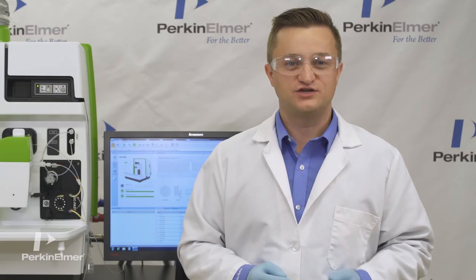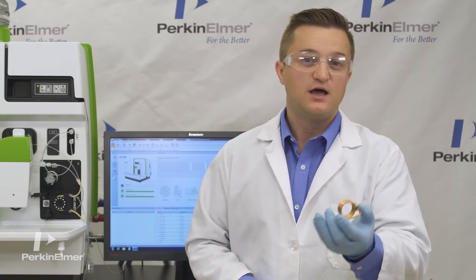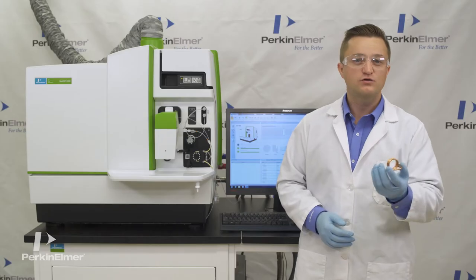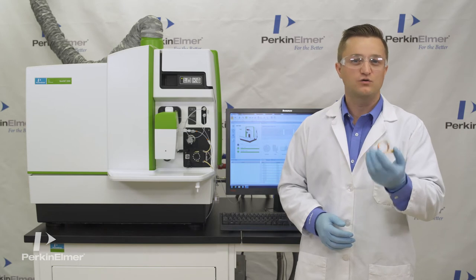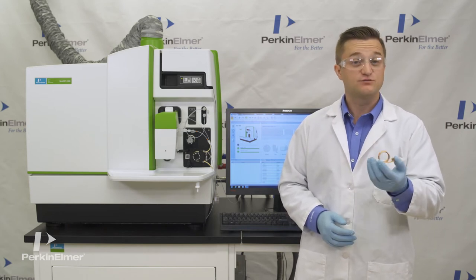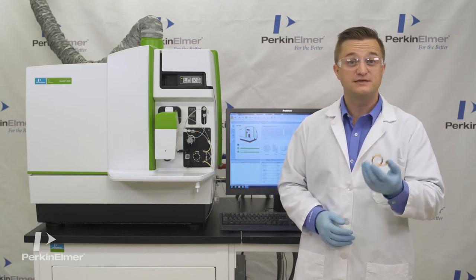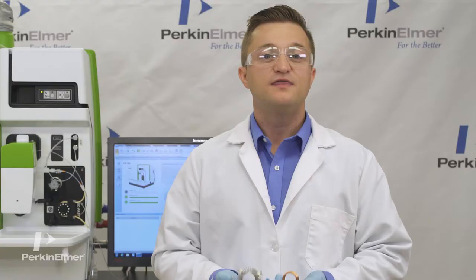Older technologies use load coils made of copper, such as this one. Copper load coils tend to oxidize when not cooled properly or in corrosive environments. As a result, they will need to be replaced regularly.